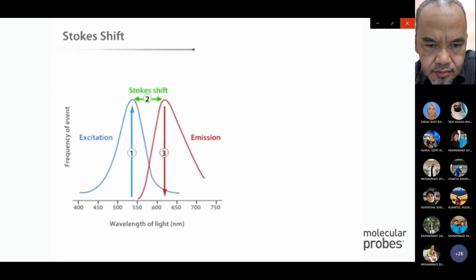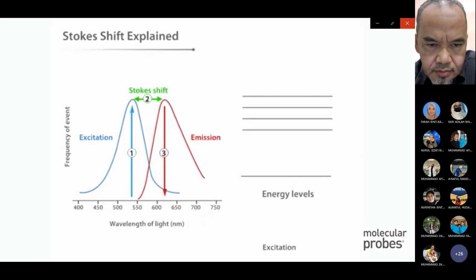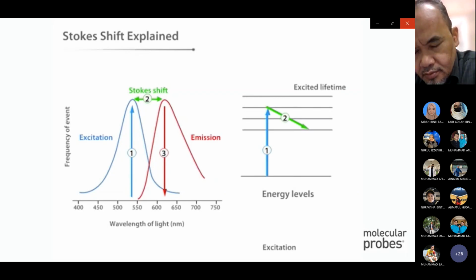The magnitude of the Stokes shift is determined by the electronic structure of the fluorophore and is a characteristic of the fluorophore molecule. So, what causes this energy loss? The Stokes shift is due to the fact that some of the energy of the excited fluorophore is lost through molecular vibrations that occur during the brief lifetime of the molecule's excited state. This energy is dissipated as heat to surrounding solvent molecules as they collide with the excited fluorophore.